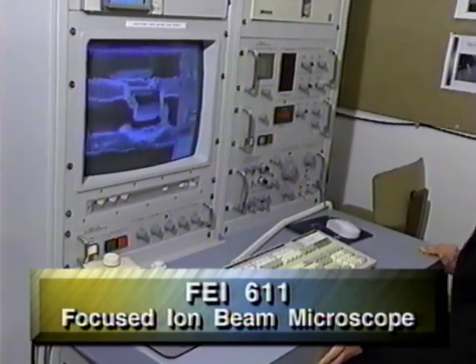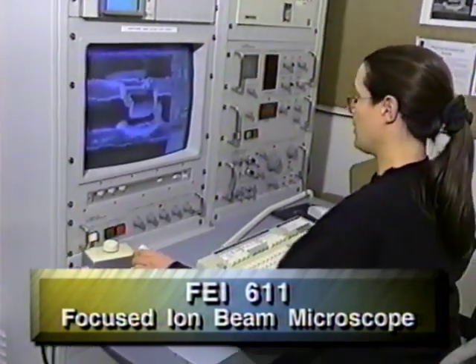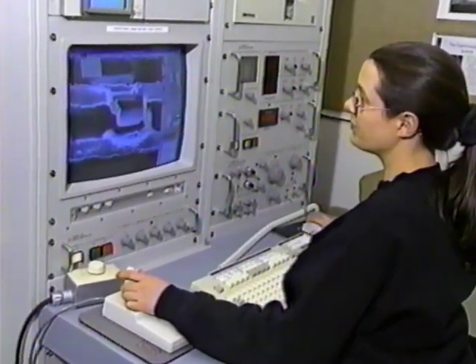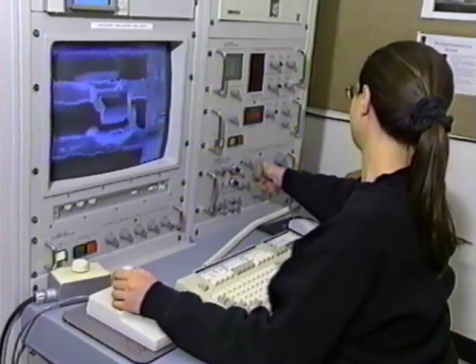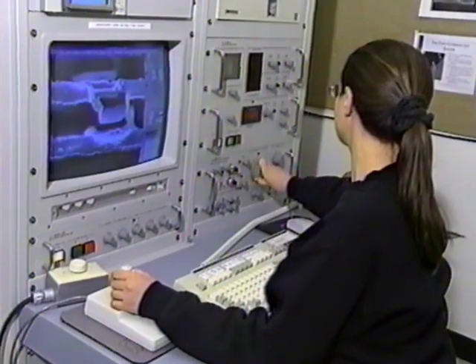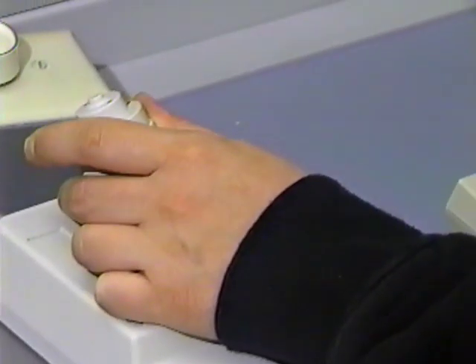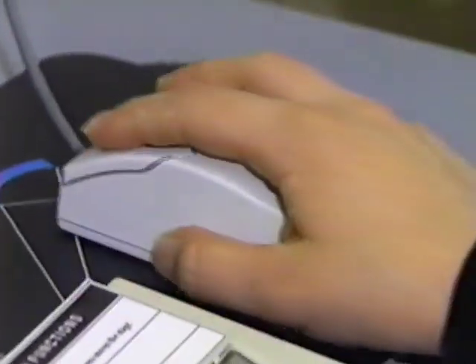This is our focused ion beam, which doesn't use electrons, it uses gallium ions. And the focused ion beam's advantage is finding faults in integrated circuits. And this is a $750,000 instrument that was donated by Intel because they're so short of focused ion beam operators, so we can integrate that into our program.